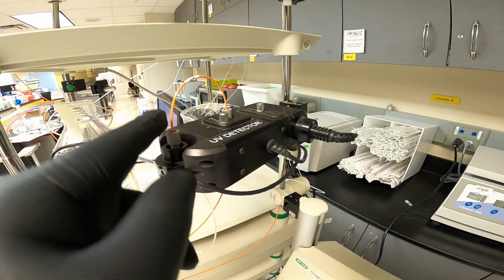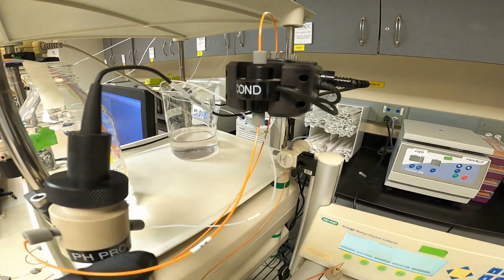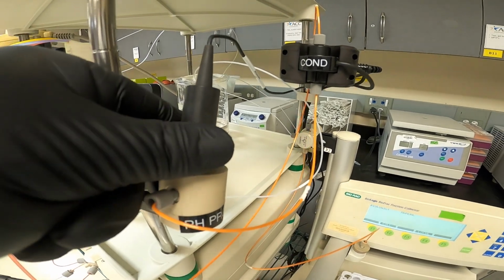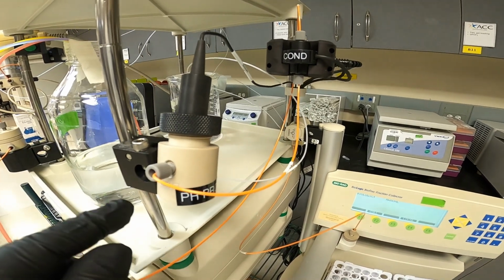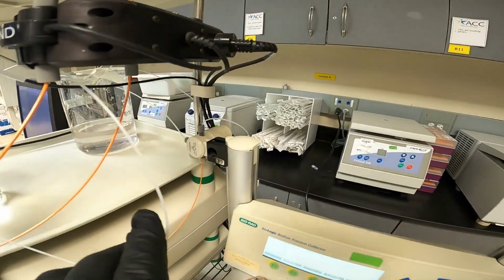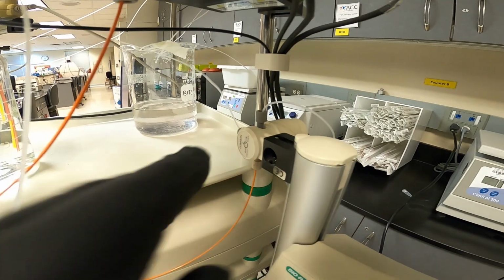And then the sample will continue flowing through the UV detector into the conductivity meter, again, which measures salt. Essentially, the more salt you add, the more conductive the mobile phase would be. And then here's our pH probe. I'll show you how to access that and get it calibrated. And then we follow the rest of the flow path down here.